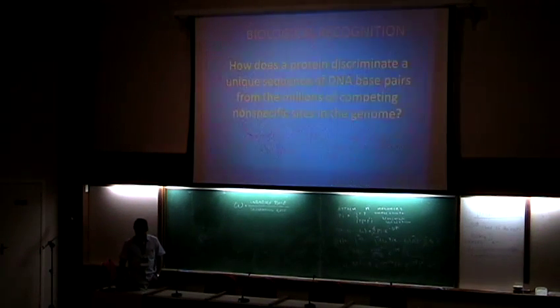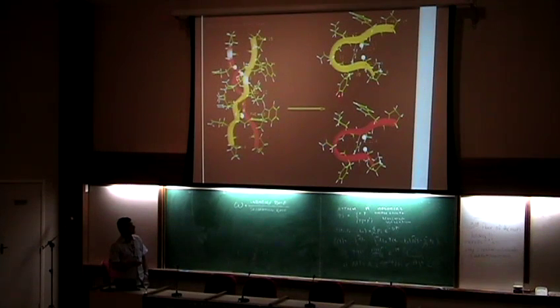The other nice thing about high pressure is that if you open the valve, you come back to the original condition very fast. That's very difficult to do when, as someone mentioned, you cook a protein and go back; it is more difficult to get reversible conditions. Here we test reversibility. Sometimes we don't have reversibility, but we can open the valve and measure kinetics, and once we release the pressure, we can look at whether the system was reversible.